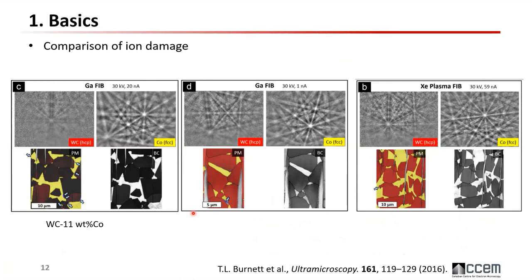Comparing with that, with xenon even at 60 nanometer step size you can still get good contrast, good-quality Kikuchi patterns with no indexing problems. By the way, what people typically do in a gallium FIB is add an additional low-current cleaning step on the surface — for example going down to 1 nanoampere — to clean the surface and improve the EBSD quality.